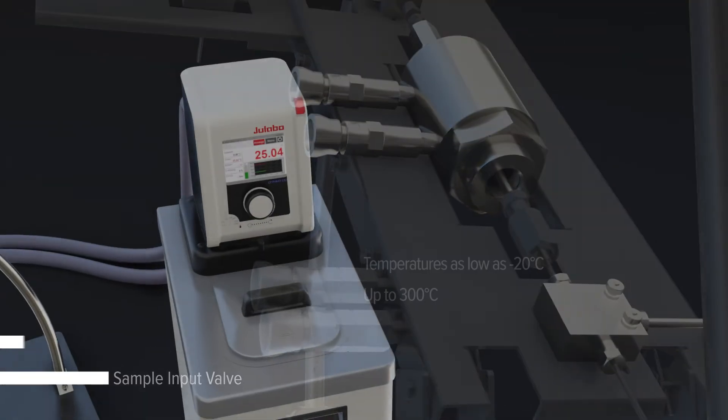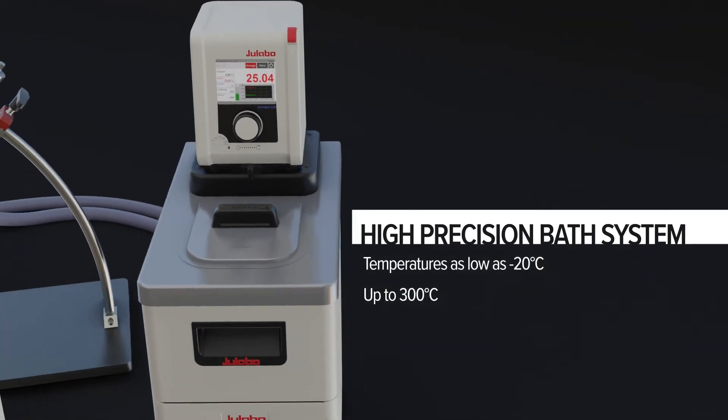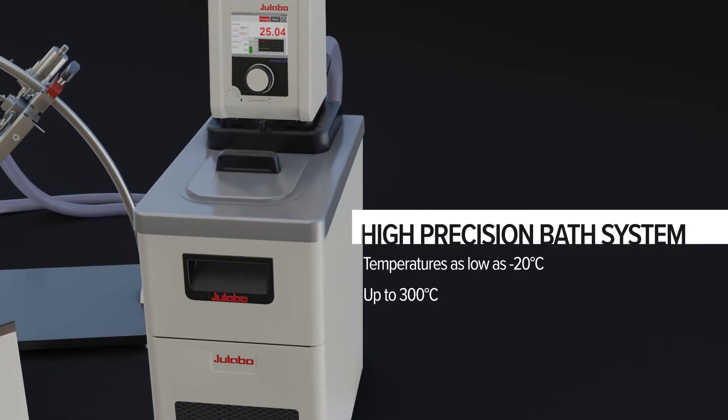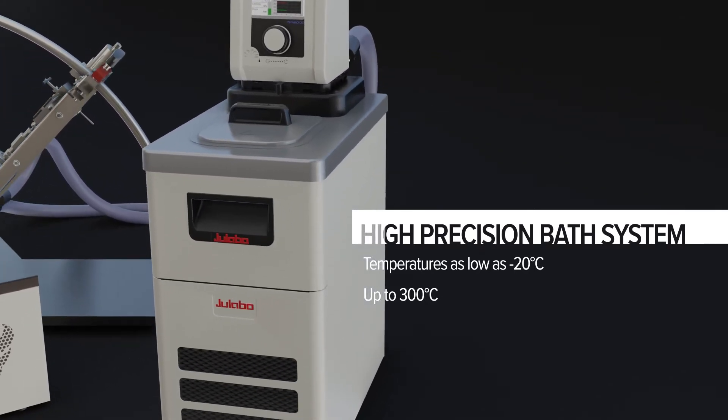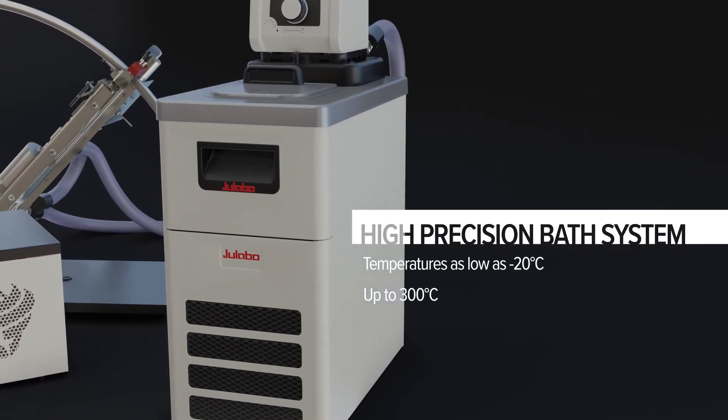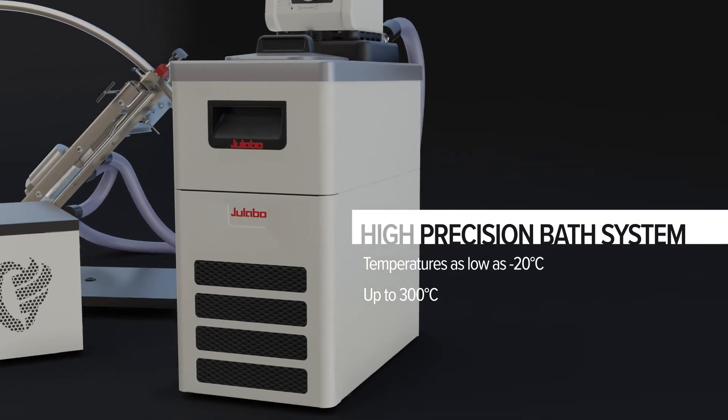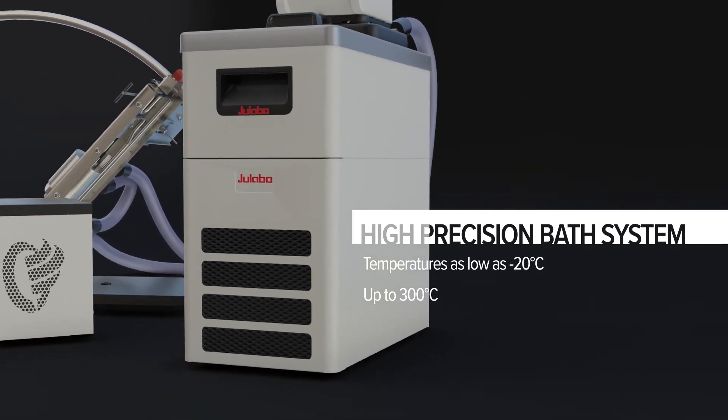The integrated high precision bath system is automatically controlled through the ViscoPro PVT Plus electronics and can be used for temperatures as low as negative 20 degrees Celsius to in excess of 300 degrees Celsius.